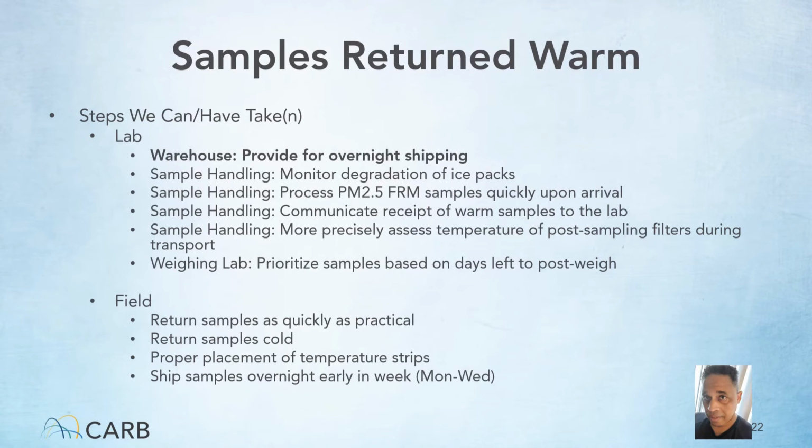In addition, sample handling is revisiting the way it's historically monitored the degradation of blue ice packs and will be making changes to its procurement process, inventory tracking, and degradation assessment of the ice packs. So all of the team members are assessing the quality of them in a consistent manner and replacing them as needed.